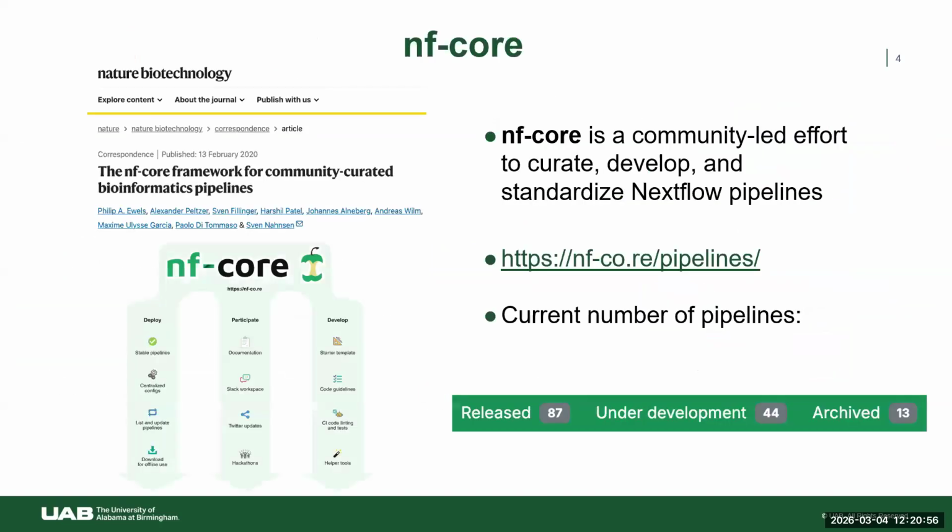With that being said, before I talk more about scnanoseq, I wanted to digress and tell you about nf-core, in case you're not familiar with this particular community. nf-core is a community-led effort to curate, develop, and standardize Nextflow workflows. This is an international community, and the great thing about them is that they have a lot of different workflows. These are all freely available. Any community member can use them, and any community member can also contribute. A big reason why nf-core has been so successful has been its open source community.